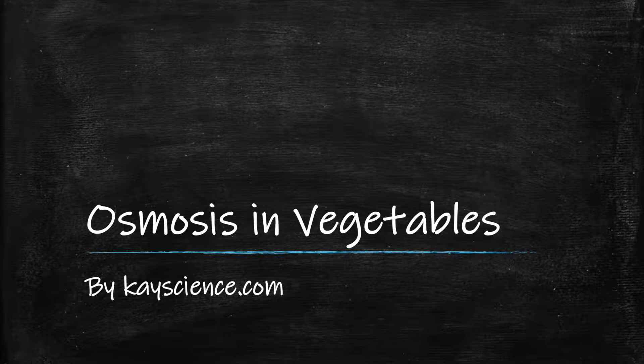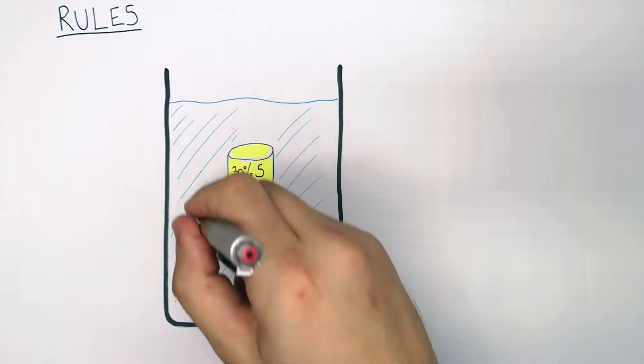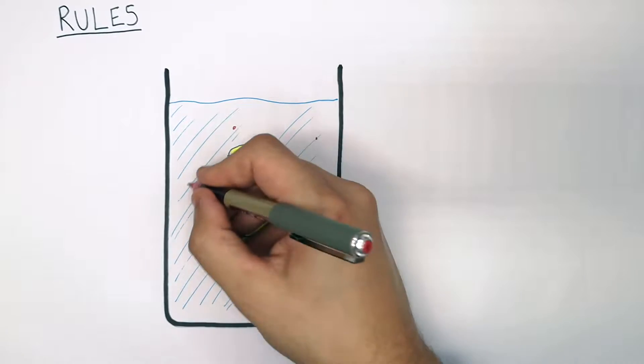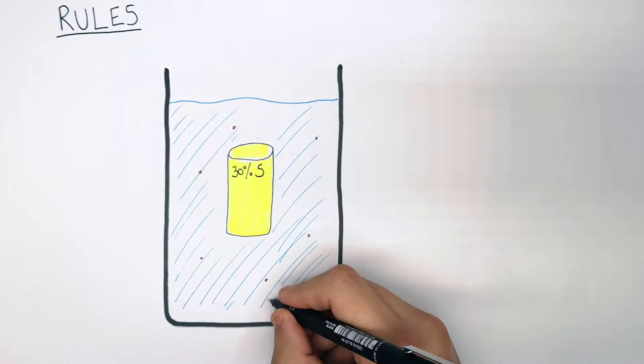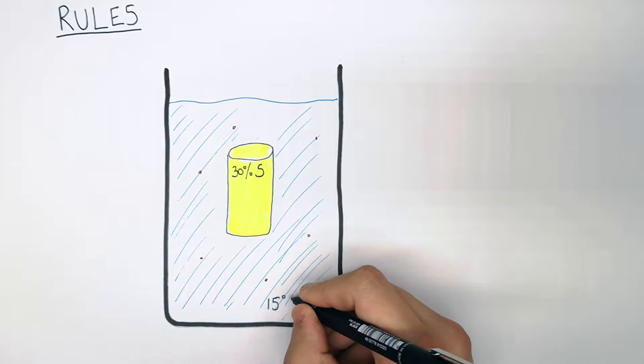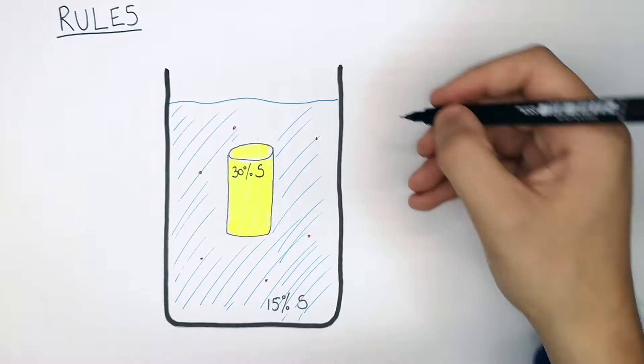Osmosis in Vegetables by kscience.com. So what I'm doing here now is adding solute, so sugar or salt, to the beaker. So in this case it's 15% sugar concentration that the potato is in.